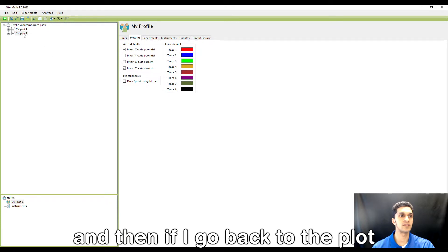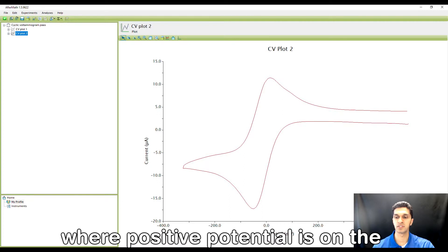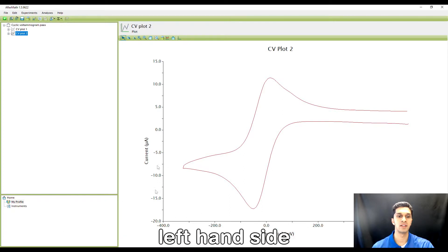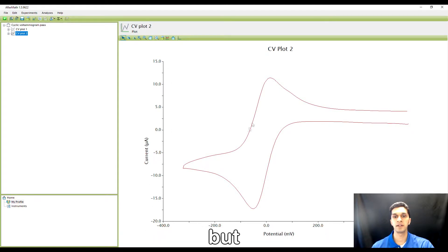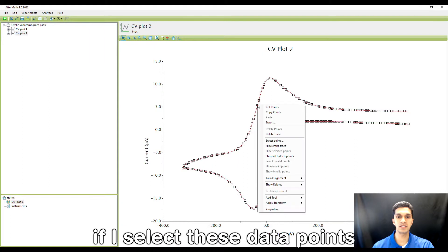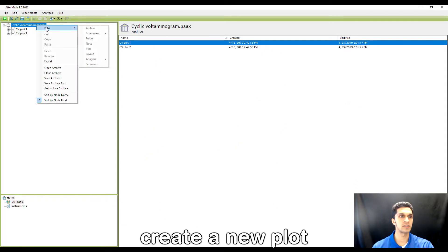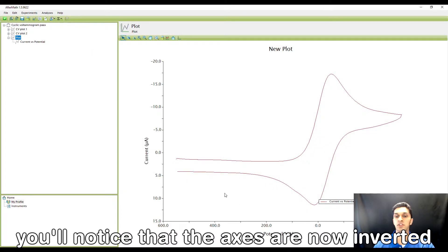If I go back to the plot, you'll notice that it looks the same as the original where positive potential is on the right-hand side, negative potential on the left-hand side, negative current is down and positive current is up. But if I select these data points, copy them, create a new plot, and then paste them, you'll notice that the axes are now inverted.